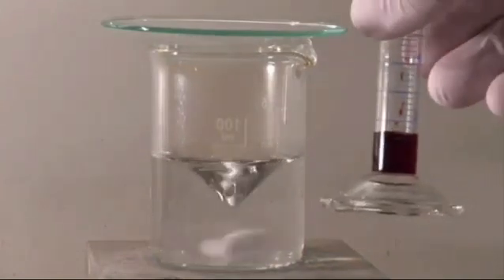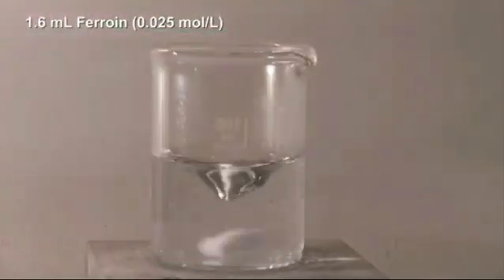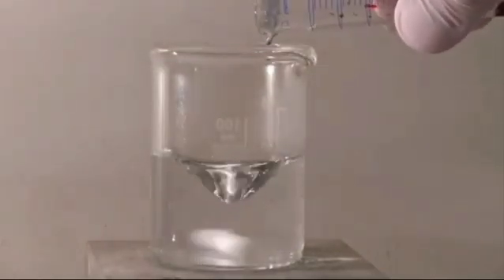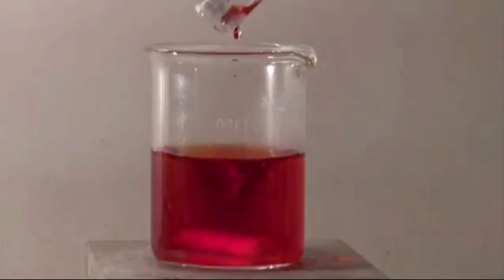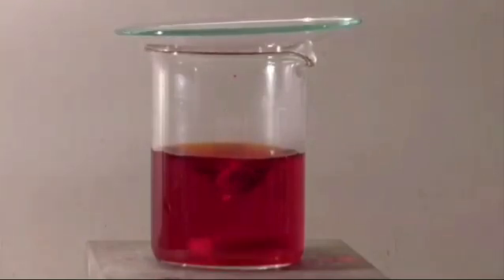When the solution is colorless, the ferroin can be added. In this case I added 1.6 milliliters. In the other runs, it was simply added until the color was intense enough to be clearly visible. In the beginning, the period, which is the duration between the color changes, was almost 2 minutes.